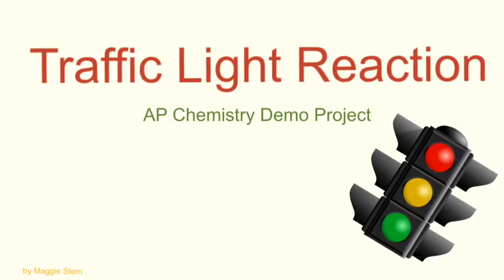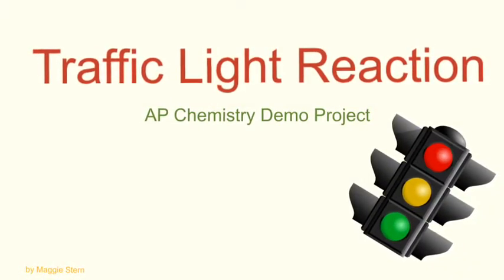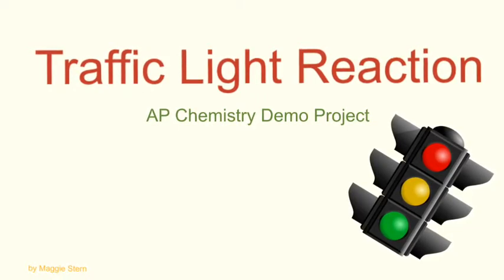This is the traffic light reaction where our solution will go from yellow to red to green just by shaking the flask and the solution within it.